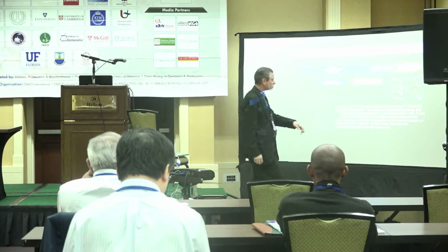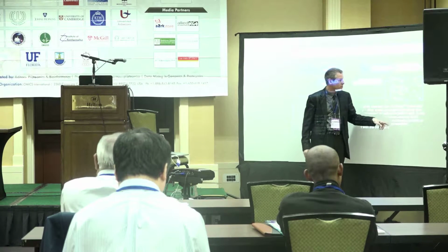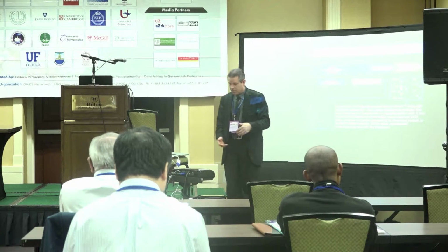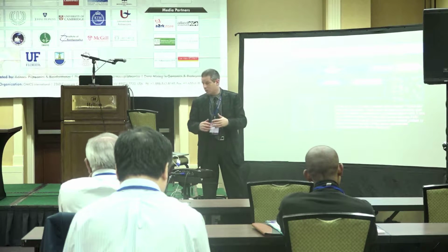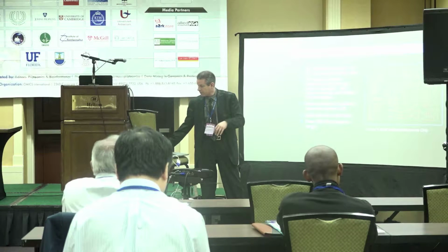So we can visualize that here, where we can see changes in response to, in this case, EGF treatment of A431 cells that overexpress EGF receptor for 5 minutes after they've been serum starved overnight. And we can quantify these, of course, and we can do this with about 3 orders of magnitude of variation.